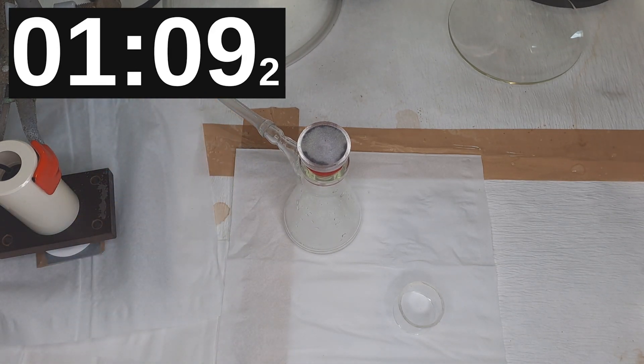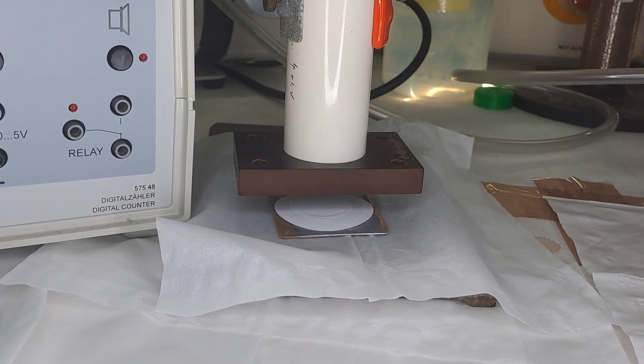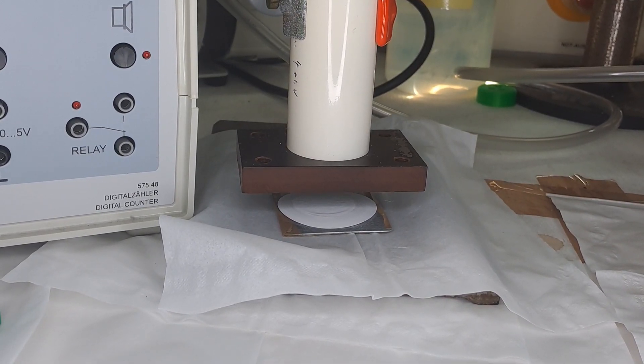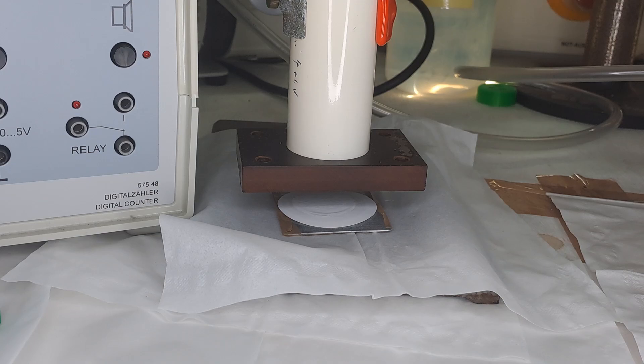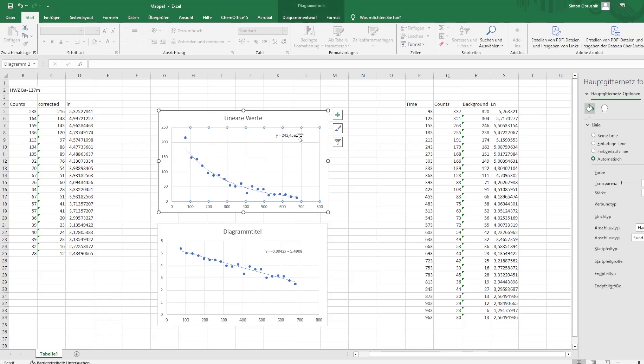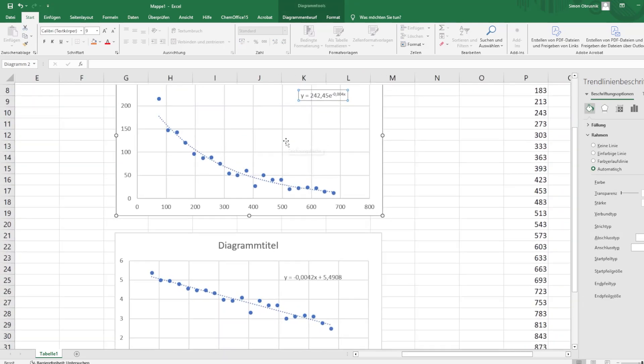Screwing with your measurement. You can observe this in a background measurement. Even after 25 minutes, you still detect barium-137M because the trapped cesium continues to produce it. You can minimize this by washing it, but ultimately, you need to correct for it mathematically by subtracting the residual production as part of the so-called background in this case. This is why it's so important to measure the filter cake after 25 minutes instead of just using the standard background.